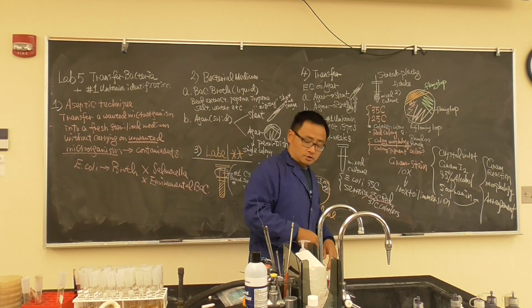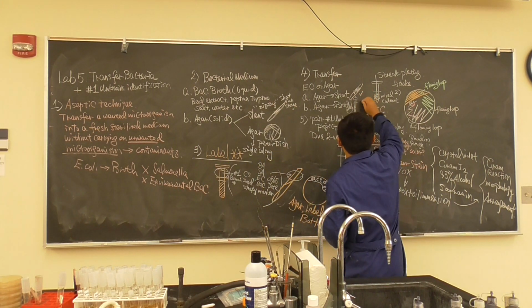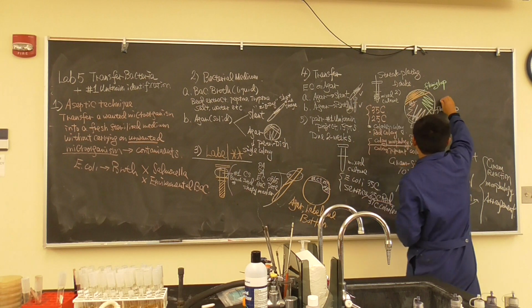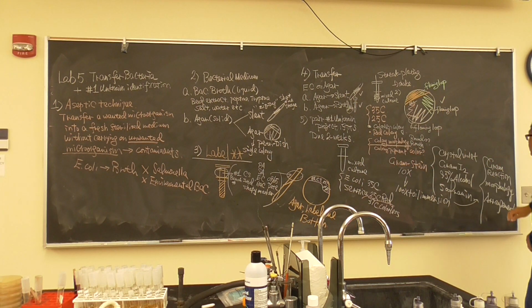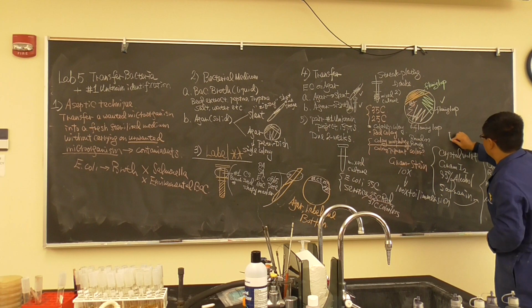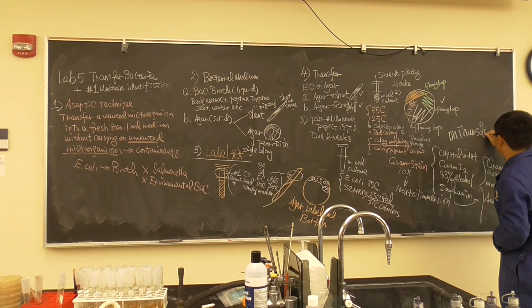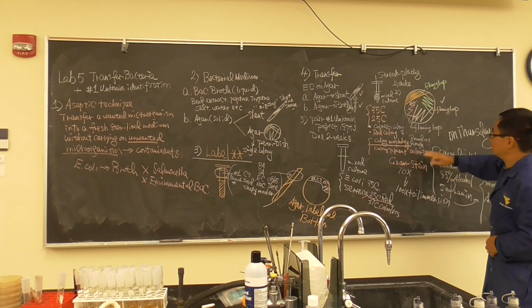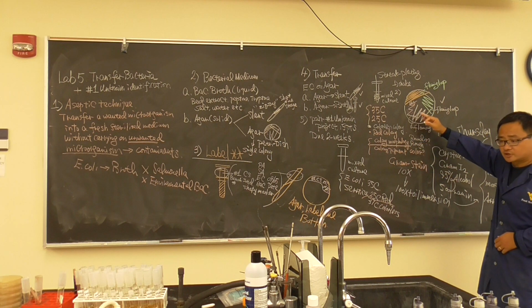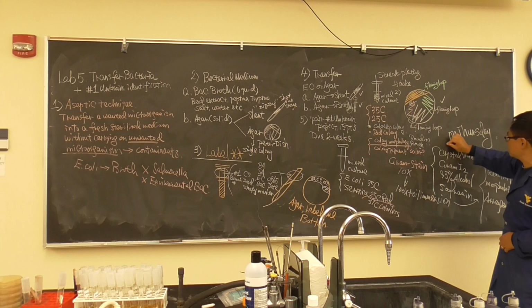So here is the thing. Today the job you're going to do is bacterial transfer 1, 2, and the streak plating. And this bunch of stuff right here will be due on Thursday. On Thursday we'll do the recording of the morphology of the bacterial colony, and do the gram stain.